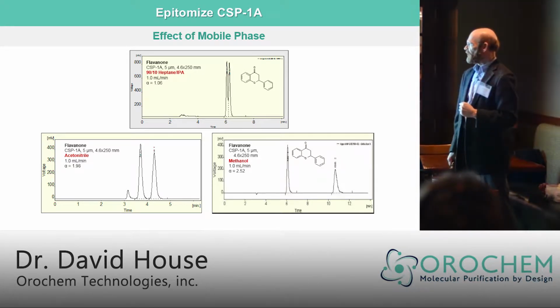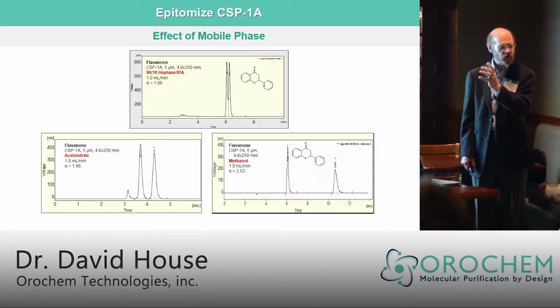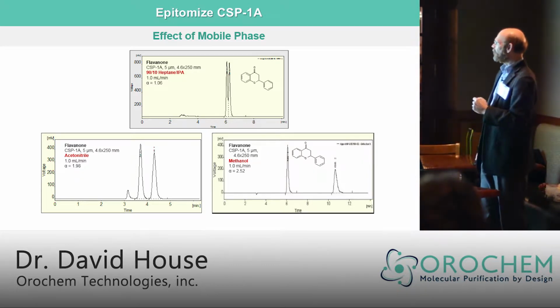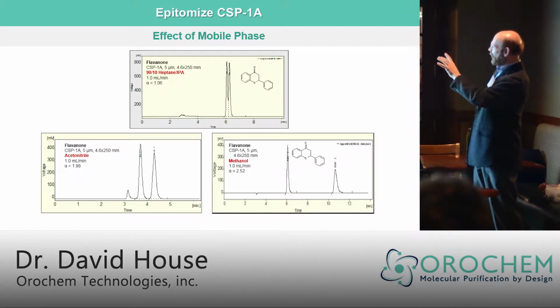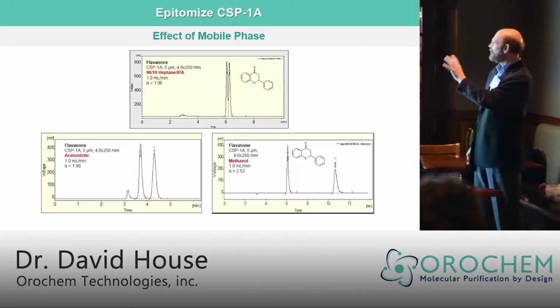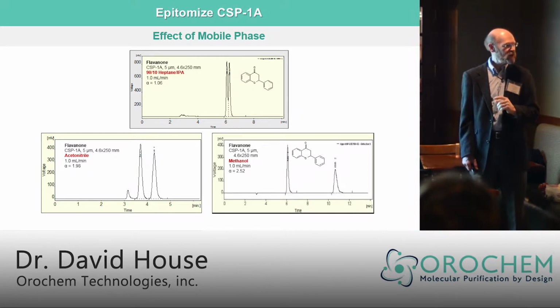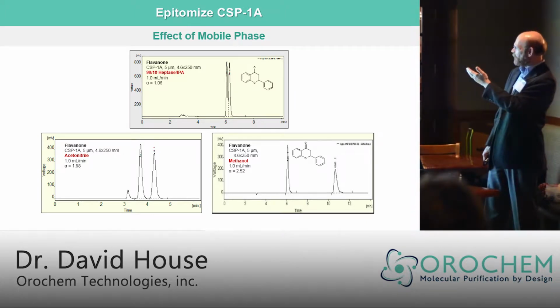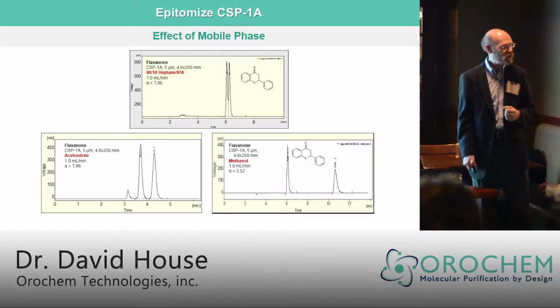Now I bring in a chiral stationary phase. It also has a pi acid, a basic group, and an acidic group. Looking at the interaction with the top optical isomer, we have a perfect interaction with the pi base and the pi acid, interaction with the acidic group with the basic group of the chiral stationary phase, and likewise the basic group of the enantiomer with the acidic group of the chiral stationary phase.